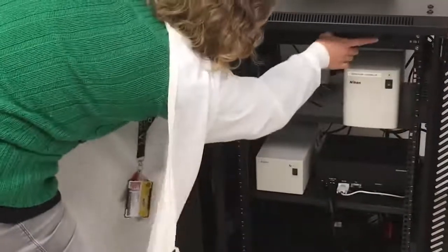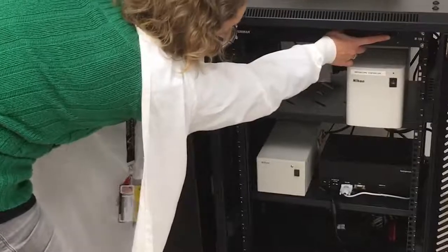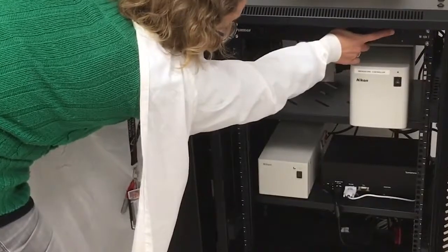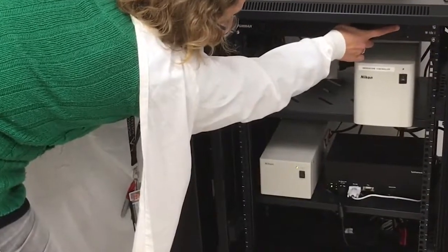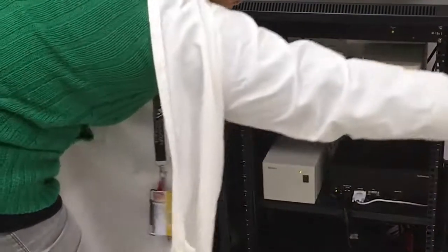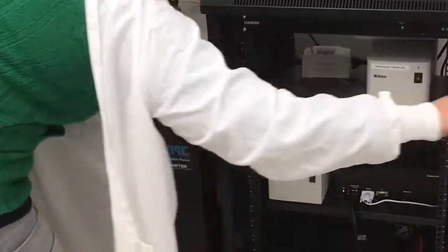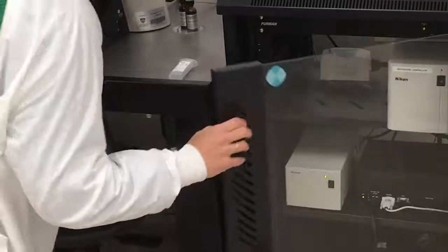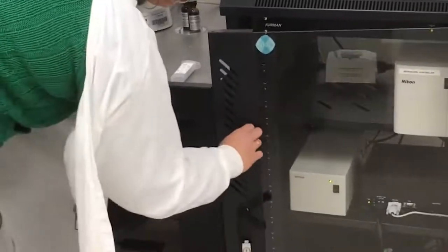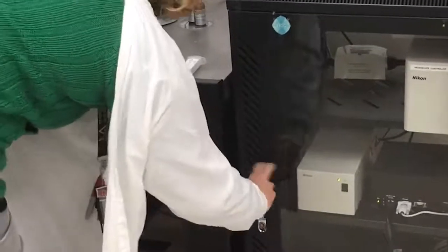Turn on the main power switch in the upper right. This will turn on all components in order. Please do not turn on or off individual components.